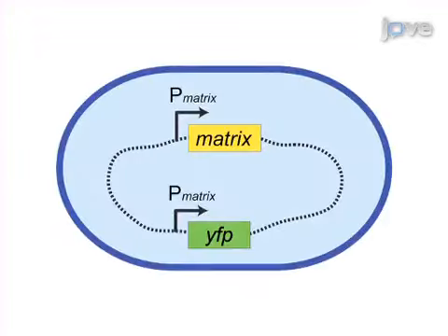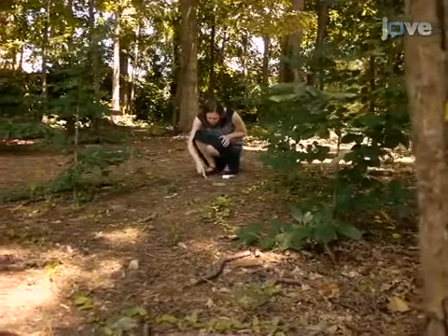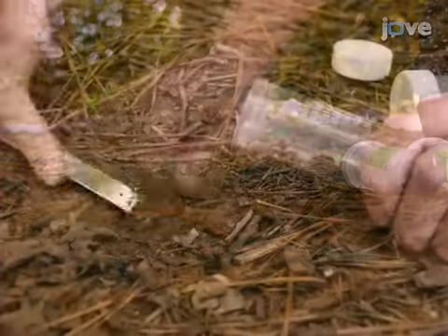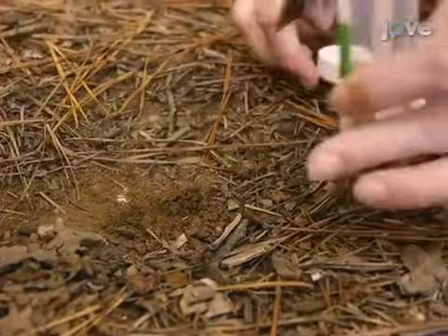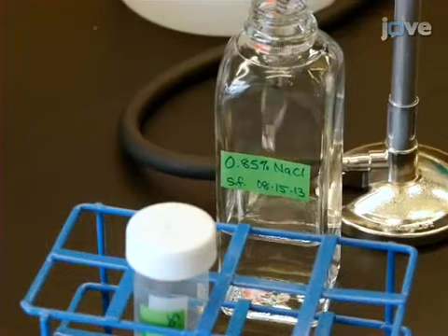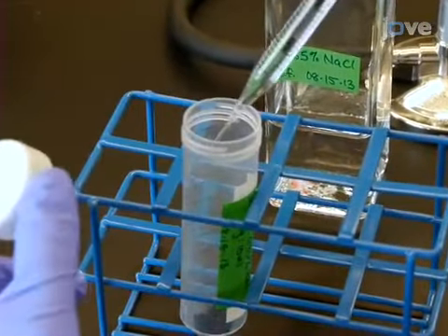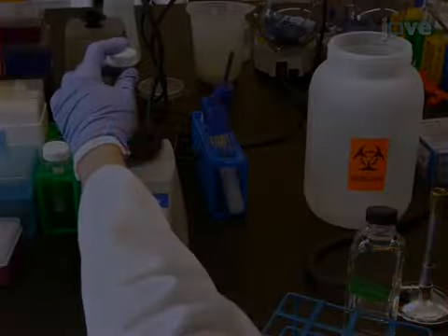After generating fluorescent reporter constructs for your organism of choice, according to the text protocol, collect soil by removing the top 0.5 centimeters of exposed surface soil before using a spatula to collect soil in conical tubes. Add 0.85% sterile saline at a ratio of 10 milliliters per 1 gram of soil to make a soil slurry, and vortex it for 1 minute.